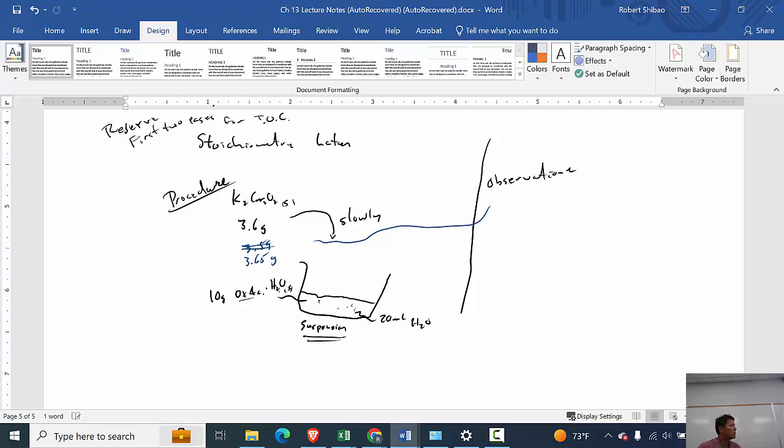It's like muddy water, but it's a white suspension because oxalic acid is white. What should happen is all the oxalic acid should dissolve with reaction of potassium dichromate. We should not see any oxalic acid remaining in this. We should get it all to dissolve. The reason is if we have undissolved oxalic acid, that is going to contaminate our final product. We don't want that to happen because our final product is also a solid.